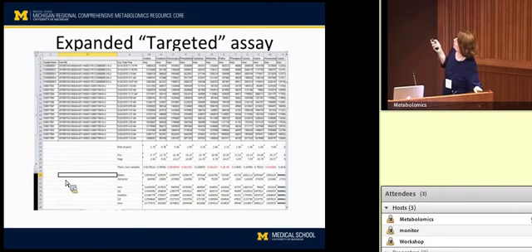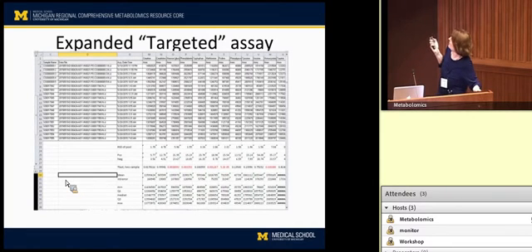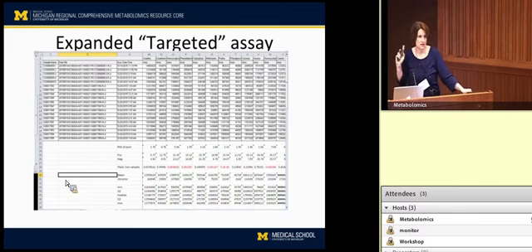And we just reported about 100 compounds in all their areas. It goes way off. I can't put that all on one screen, obviously. I briefly did some statistics for her, and we could see huge differences in some of the amino acids and the nucleotides for her sample. So if she had just asked for TCA analysis, she may not have seen this. We were really pleased to be able to offer this.